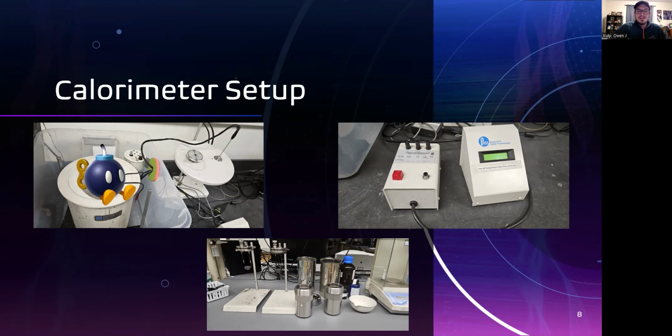Once the bomb is ready to go, it is placed into the stirrer, which you see here on the top left, and submerged in the water, where it was then hooked up to our detonator and temperature probe as seen on the right. The temperature was measured for a brief period to get a baseline, and then we pressed that red button, and you know what that means.